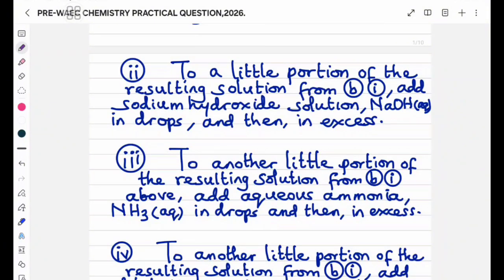Why is it that it won't dissolve completely? In fact, it's going to form a kind of suspension. It will look like a whitish suspension. But if you observe it closely, you will see bubbling taking place. That means reaction is ongoing. Bubbling will be taking place. It's a sign that a gas is released from that reaction.